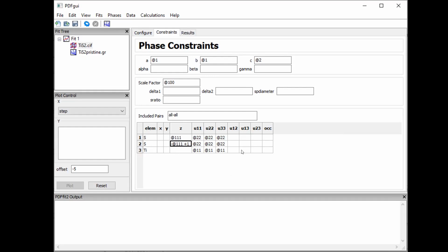For example, you may have a 10 or 20 atom list. If you apply this kind of symmetry constraint atomic position fitting, it will automatically define the minimum number of atomic positions, with other atomic positions related by symmetry automatically following this defined parameter. So basically, we have already finished the definition of the fitted parameters in this panel.